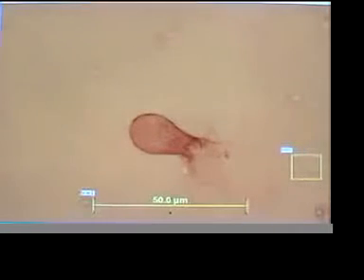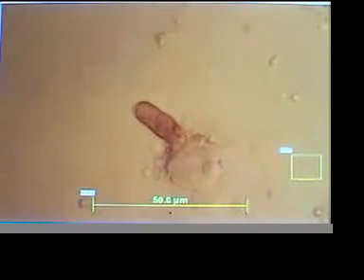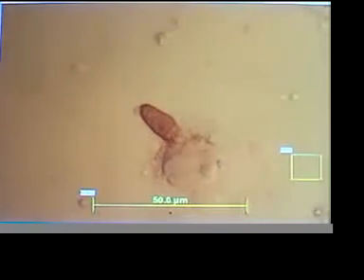Let's see if we can get that sort of contrast effect we had before. Oh, I don't want to interrupt this process. There we go. Now you see a little surface texture. I'm cheating a little touch of red filter in there. This is a real-time devitalization of a Blepharisma using a plasma light, which is sitting about 5 inches away from the center of the slide. And here we've added a little touch of red filter.